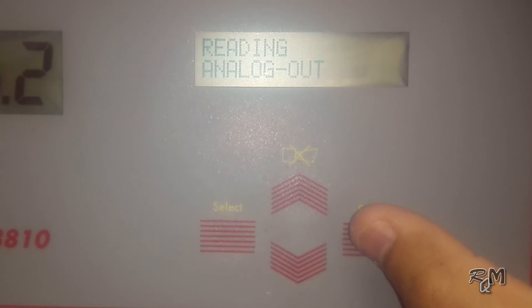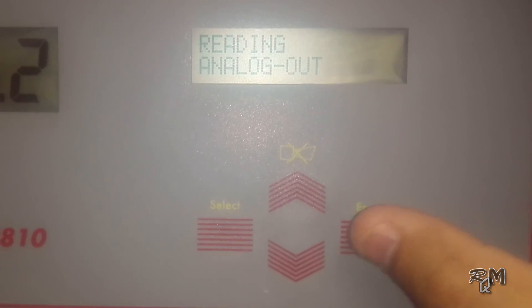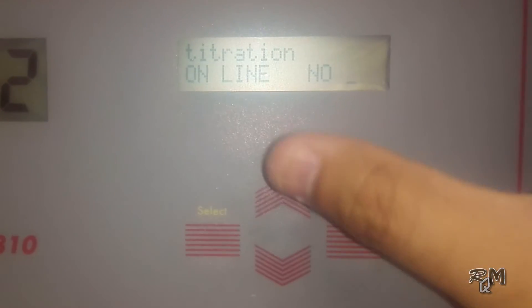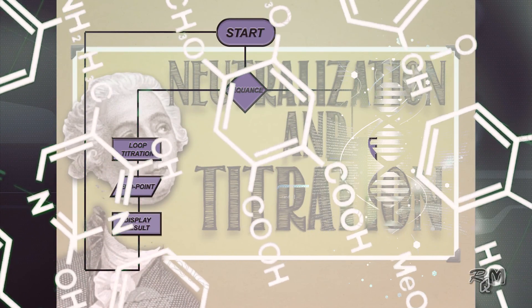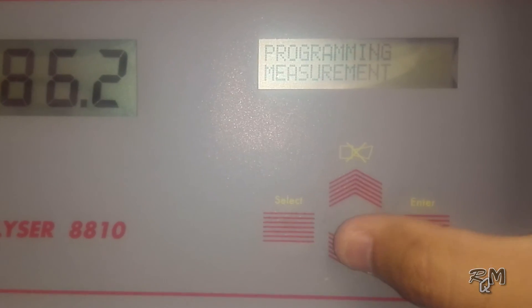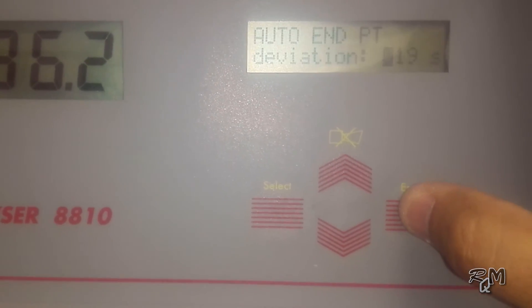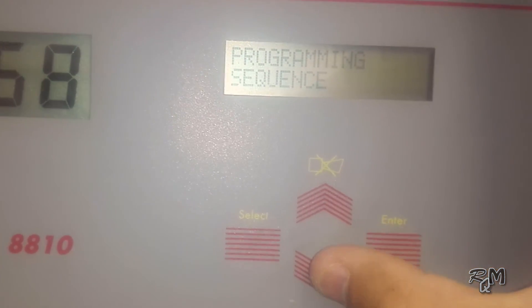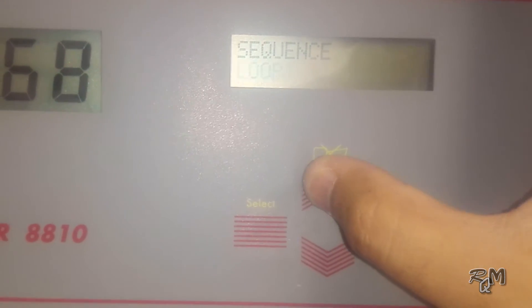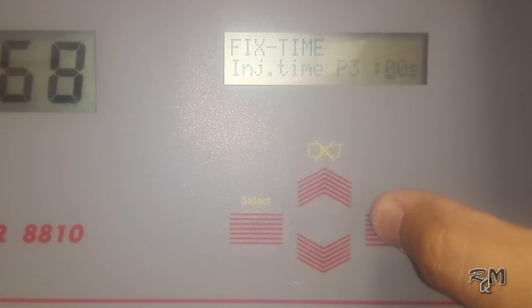Next is analog output settings showing the lower and upper values of the analyzer. After this there is the calibration menu, which you can use for online calibration without stopping the analyzer. I hope you understand how to perform physical checks and basic configuration of this analyzer. One thing remaining is how to determine the endpoint, which you saw in the sub-menu of the measurement menu. This endpoint value is an important parameter for analyzer operation and can be obtained using the Plot ORP sequence — this is an 8 to 10 minute process which I will show in the next part. After getting the correct endpoint, you can perform calibration easily. So meet you again in the next part of this analyzer — thanks and bye.